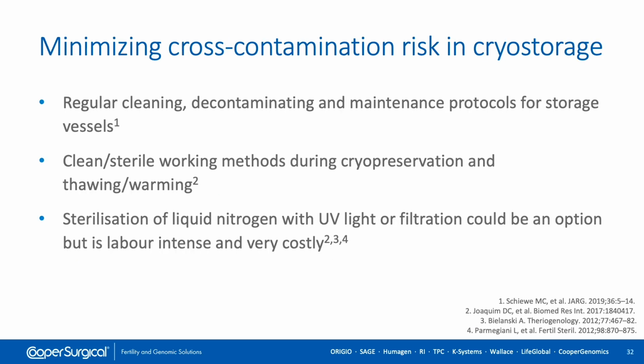Further measures that can be taken to minimize the risk of cross-contamination include cleaning and decontamination of storage vessels and adopting sterile technique during cryopreservation. UV or filter sterilization of liquid nitrogen is an option, but is labor-intensive and costly.